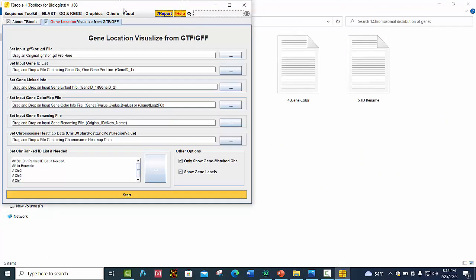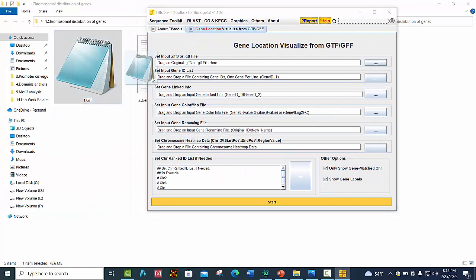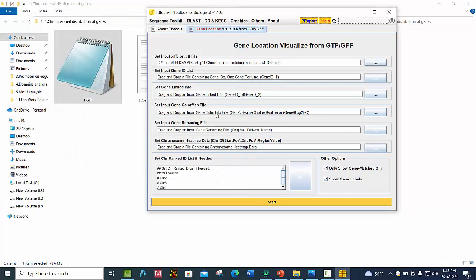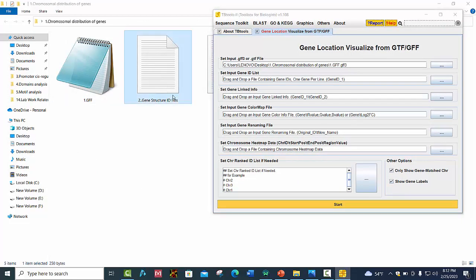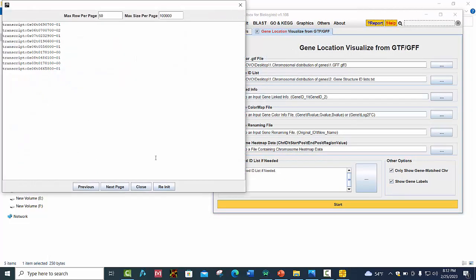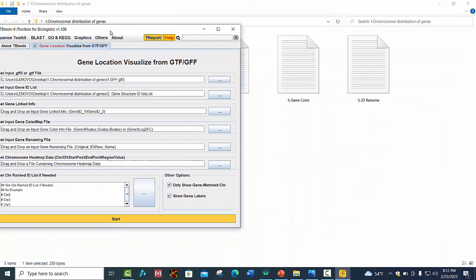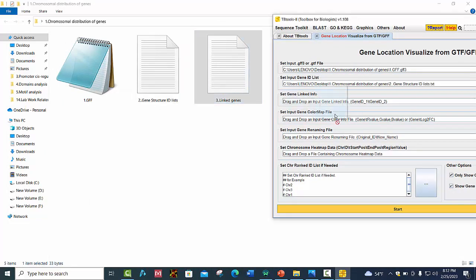First, we need the GFF file of our genes — place it here. Next is the gene structure ID list, and then the link gene file — drop it here.